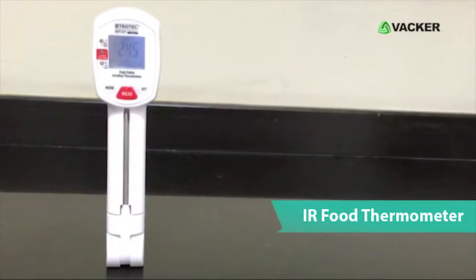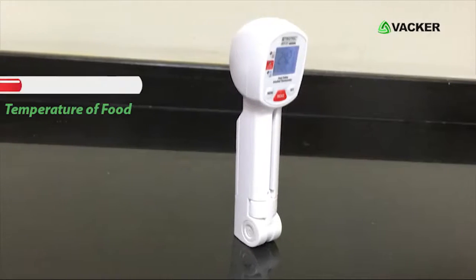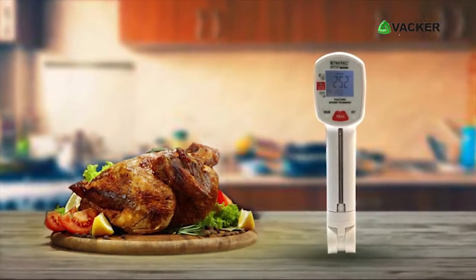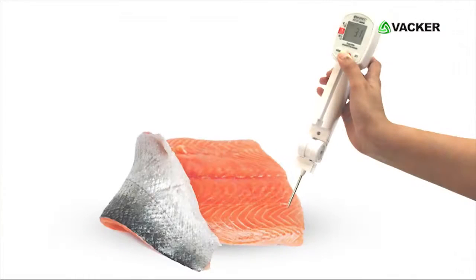This is the infrared-based food probe thermometer, model BP5F. This device is used to measure the temperature of food. Temperature of food can be monitored using the infrared beam available in the device. You may also check the temperature by simply inserting the probe.